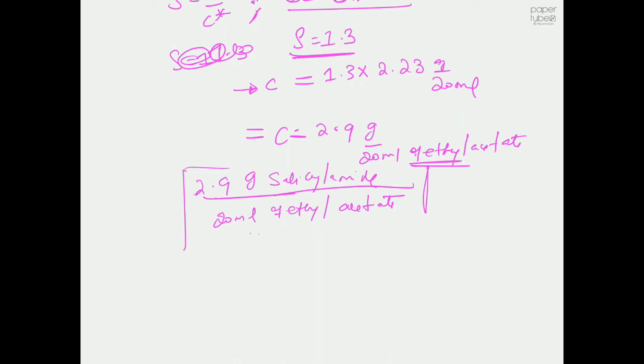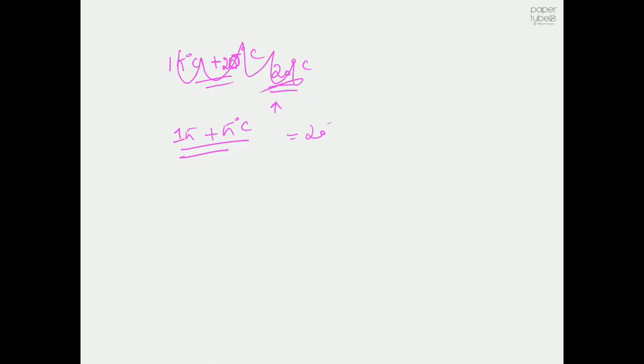So normally what we do is we raise the temperature from 15 degrees centigrade to plus 5 degrees centigrade. So that will be 20 degrees centigrade. At this particular temperature, everything should be dissolved. Sometimes we even heat to 15 plus 20 degrees centigrade, but normally for a nucleation experiment, we won't go more than 5 degrees centigrade. So 15 plus 5, that will be 20 degrees centigrade.